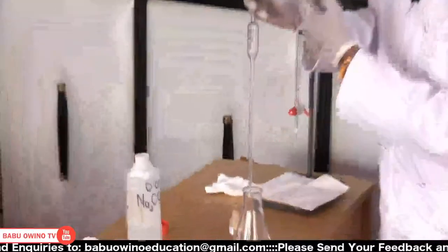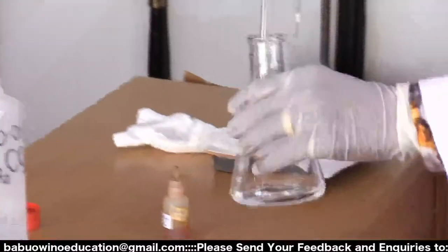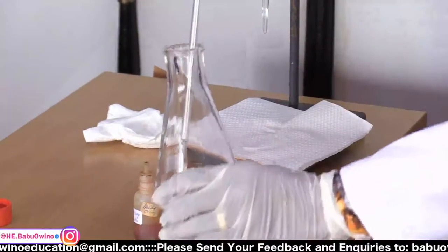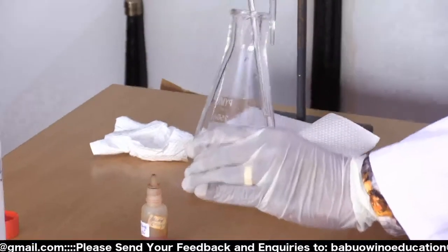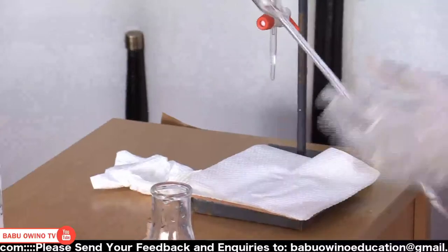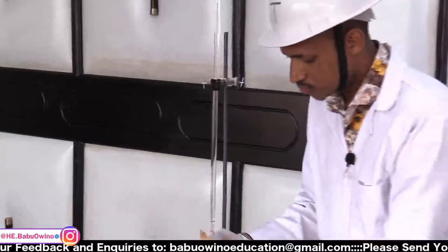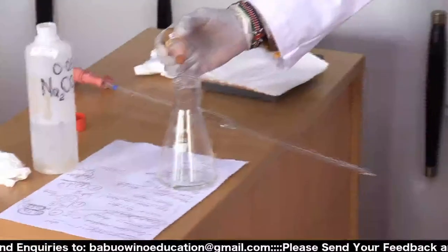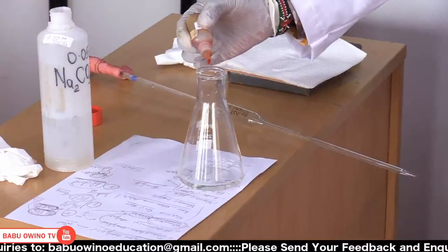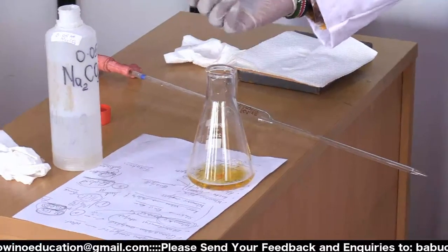Yes. So before you put your indicator, you'll realize that your pipette has some solution remaining. So ensure that you don't, because when you press it, you shall have released everything. So just knock the tip of the pipette on the conical flask. Then after that, you don't worry about the solution remaining because it has been taken care of. So here you put 2 to 3 drops. In our case, we put 2 drops. That is first drop, second drop.